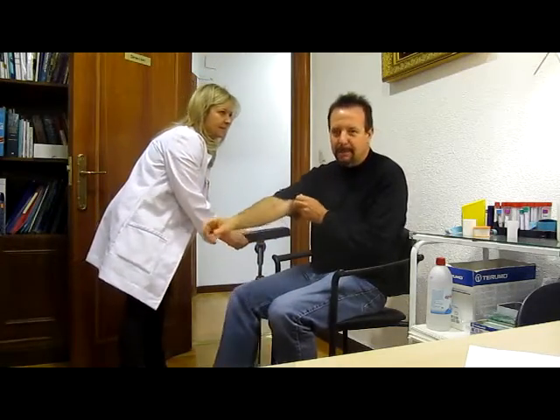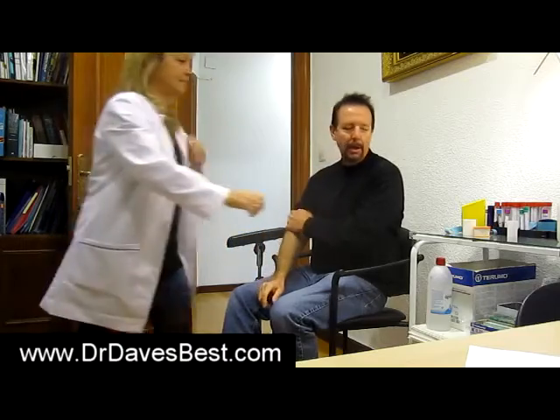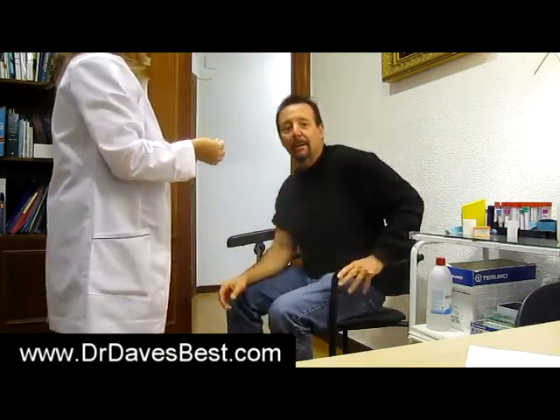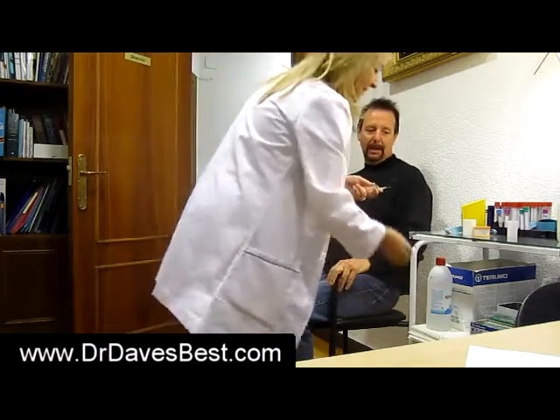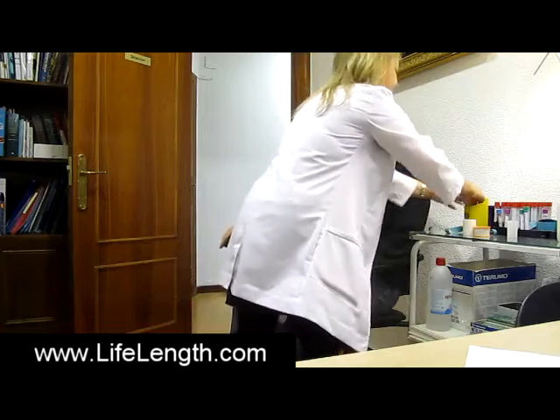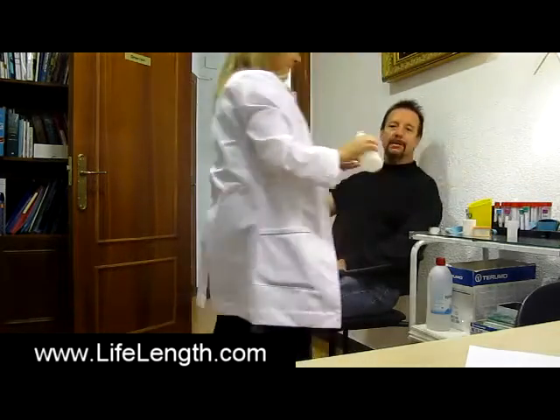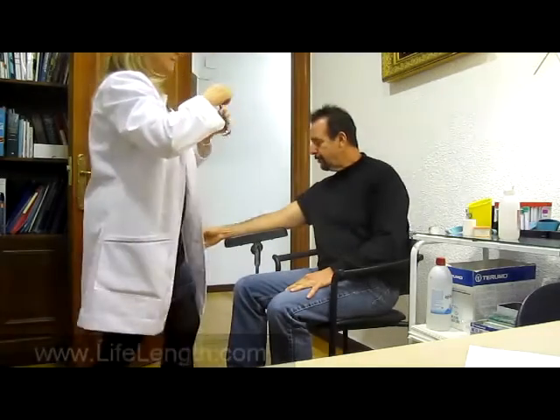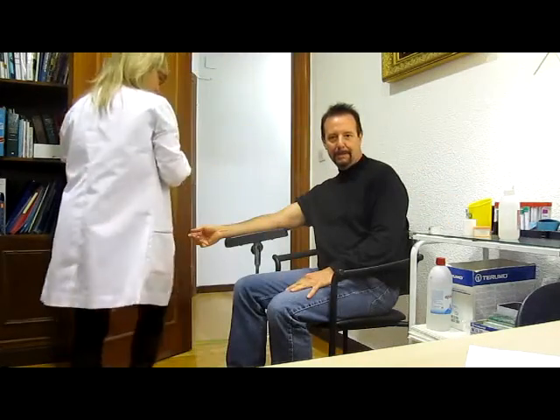Good morning everybody. Buenos dias from Madrid, Spain. I'm here with Dr. Maria Jesus Cortez, who is going to be doing the Life Length assay, the HTQ FISH, or short telomere test as we know it. And point of fact, it's actually not just a short telomere test, it's an everyday telomere test. You folks might like to see how it's done.